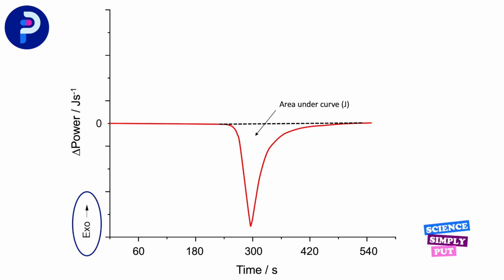Therefore, it's very important that we note on the DSC plot in which direction data are being shown. We do this with an arrow on the y-axis showing whether exothermic events are being plotted as positive values, exo up, or negative values, exo down. Without this information, interpreting DSC data can be very tricky. My instruments plot exo up, and so endothermic events such as melting are shown as downward peaks, as I have drawn. We just need to remember that because these negative peaks represent endothermic processes, we must report the area as a positive.